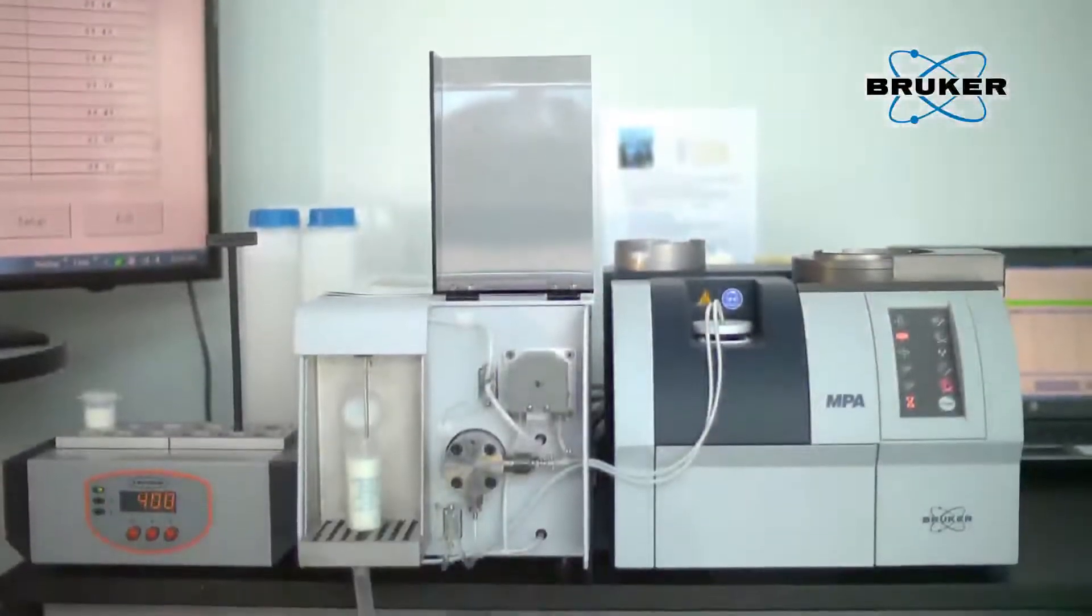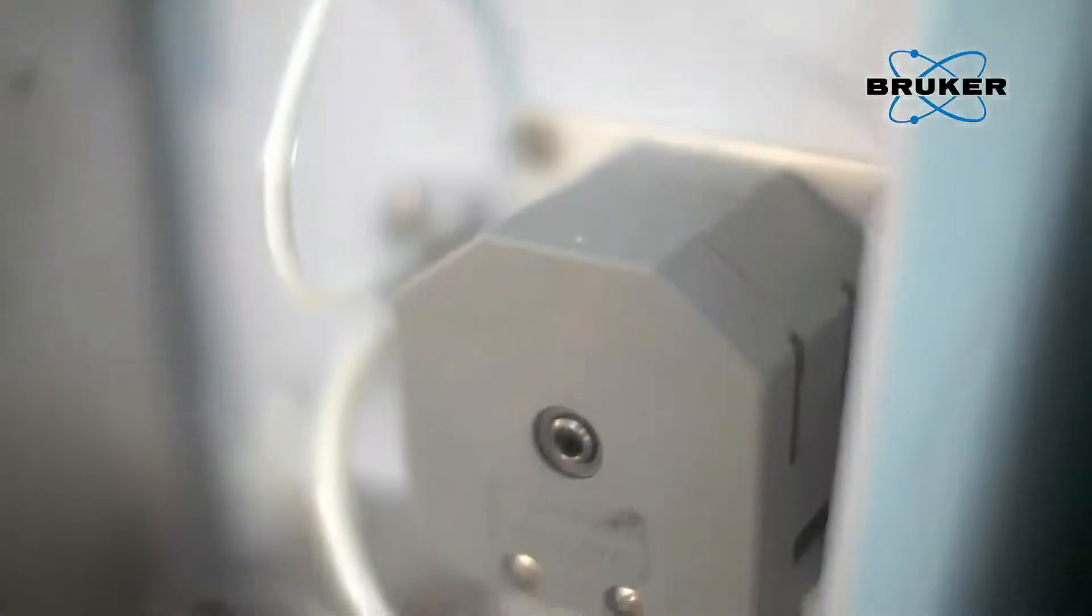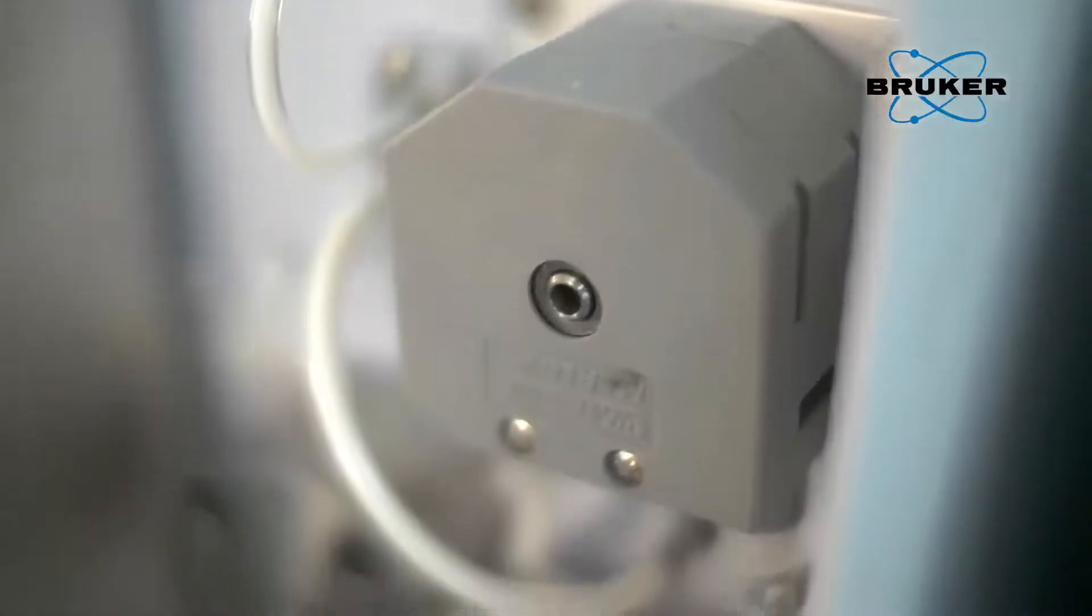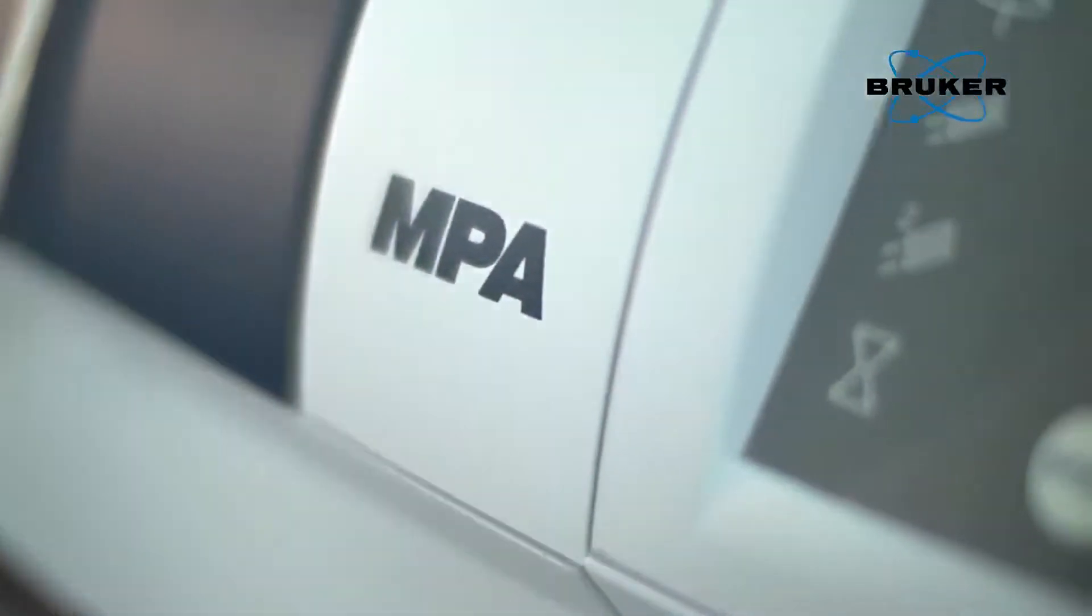The MPA Dairy System from Bruker routinely measures fat, protein, lactose, and total solids in milk and cream simultaneously, with accuracy and precision as good or better than AOAC-approved reference methods.